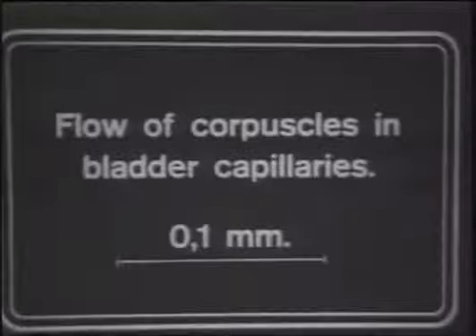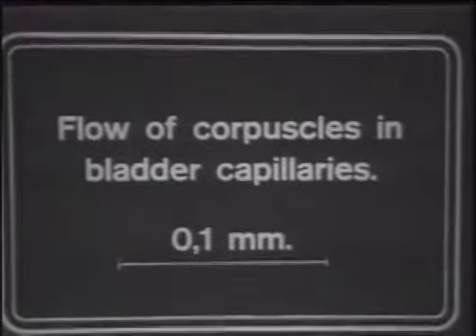Capillaries and small blood vessels. It's an amazingly elegant motion picture considering when it was made, in the late 1919 and 1920. Most of the images are from capillaries and blood vessels in the frog, and for that reason the red blood cells are elliptical in shape and are nucleated, as you can see in this scene.